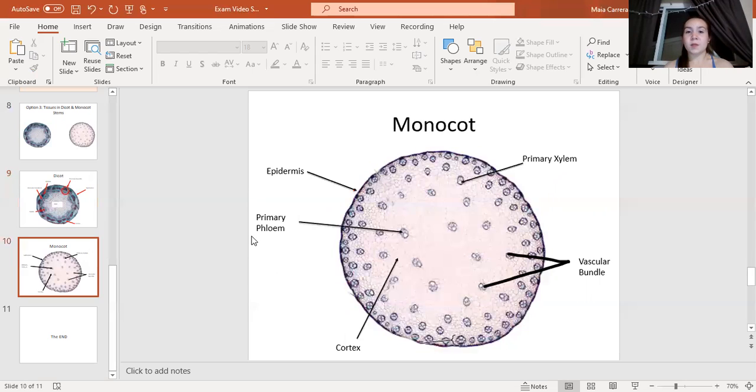And on our second slide, we have the monocot. As stated before, mono meaning one, so it only has one layer of growth, as you can see here with just the single layer of the epidermis. So here, there's not as many items to be pointed out because the monocot doesn't grow anything too complicated. So here we have the vascular bundles, as you can see, with the several different dots. And then hopefully you can see this small little lump right there.